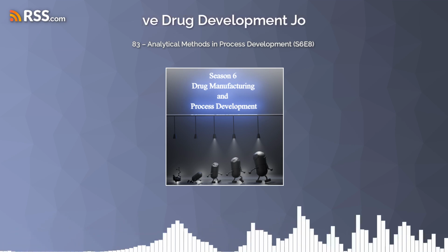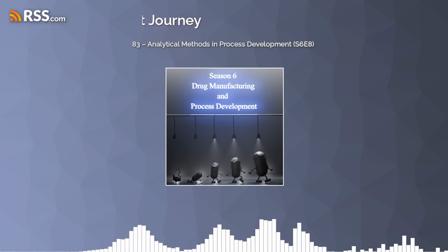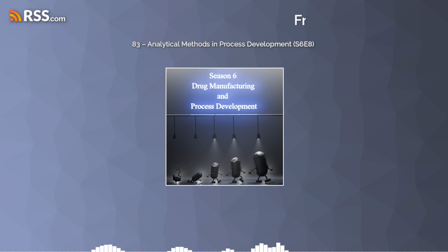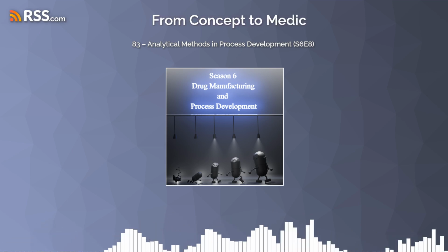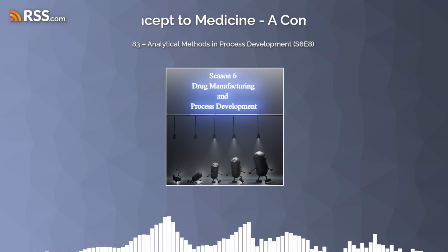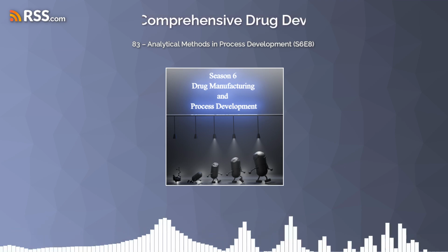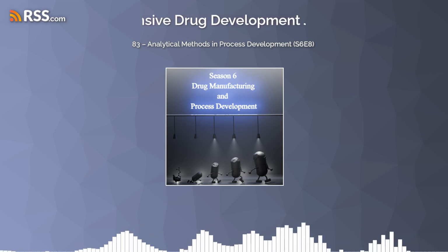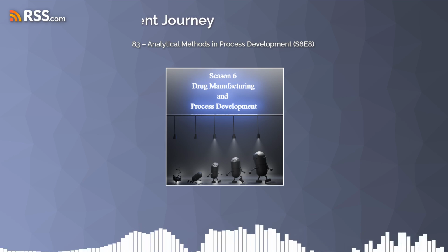It is. And finally, in OPR&D 2021D, they detail a continuous flow ether synthesis. In this one, they use GC-FID, which stands for gas chromatography with flame ionization detection. What does that do? This technique is used to determine the conversion and yield of the desired product under different flow rates and using an inline separation technique.